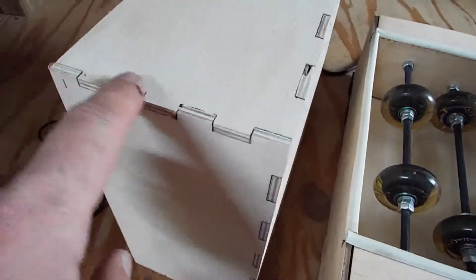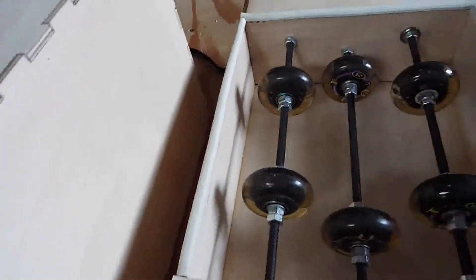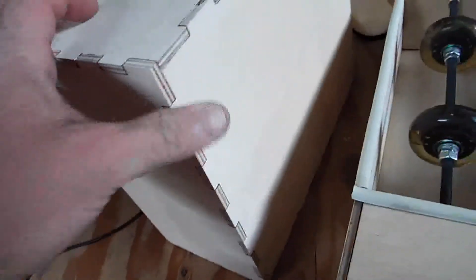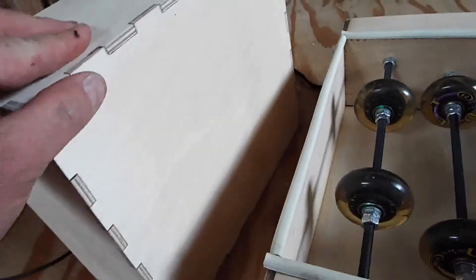I laser cut the entire assembly. Everything is designed in Inkscape actually, of all places. And then I cut it out of birch plywood and glued the whole assembly together.